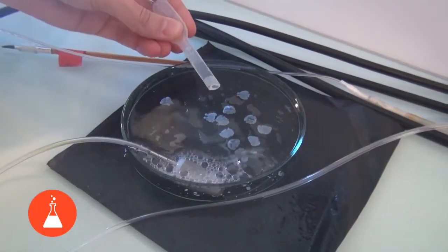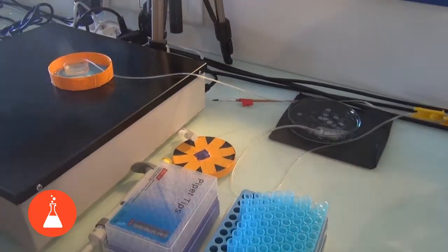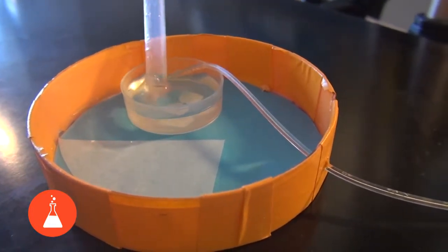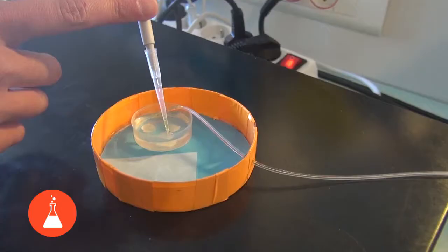We are going to select 3 brain sections based on the presence of an area of the brain that we want to investigate, and also the quality of these slices.